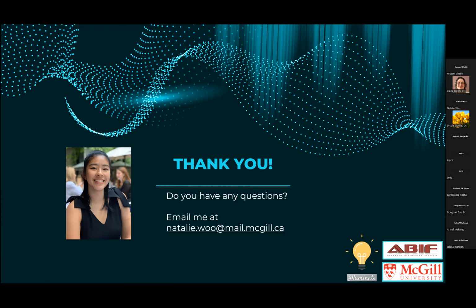But you can probably order. I think the problem that I had was they couldn't find a supplier, so it was back ordered for over a year, and I was like, that's going to be half of my master's. But all the other stuff, they require quite a minute amount each time. So for the most part, you're really using PBS and water. The other reagents, I thought I had to use a lot of, but really I ended up aliquoting a lot of it. Once you've prepared your solutions, it can be frozen and kept at -20 degrees for quite a while.